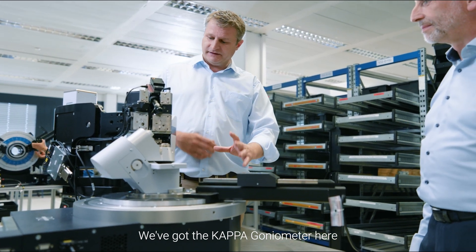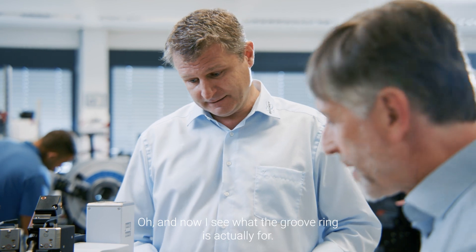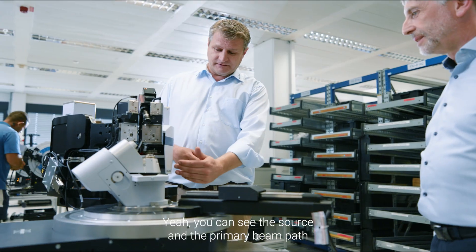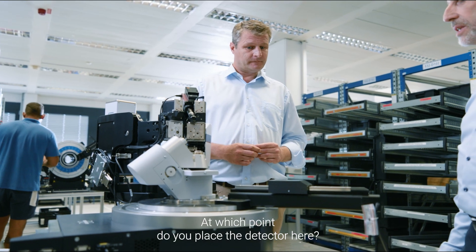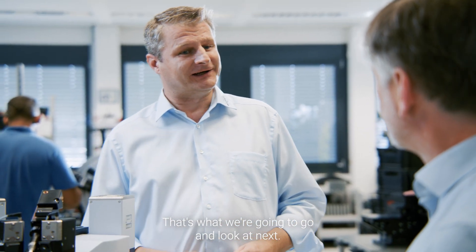We've got the kappa goniometer here and we've got the two sources and the primary beam paths mounted on there. Now I see what the groove ring is actually for — you can see the source and the primary beam path are already mounted on there. At which point do you place the detector here? Well, it's good you ask that — that's what we're going to go and look at next.